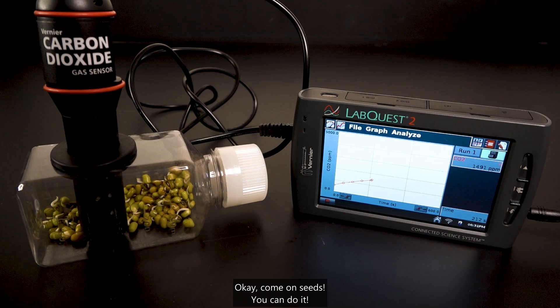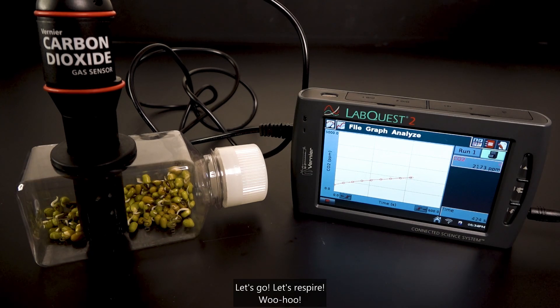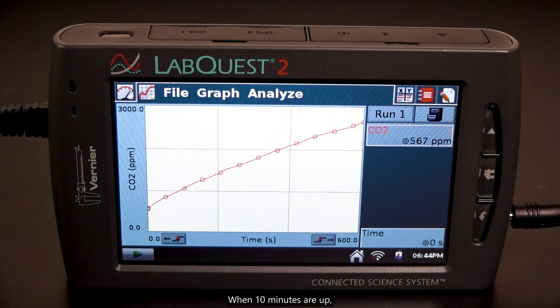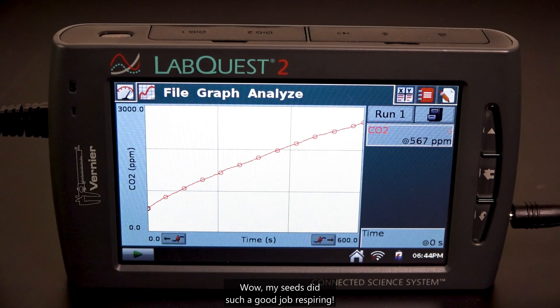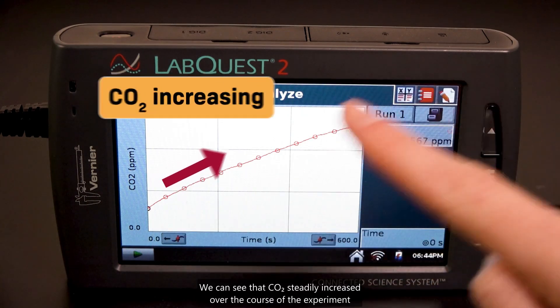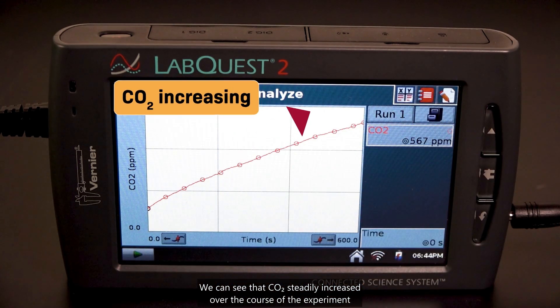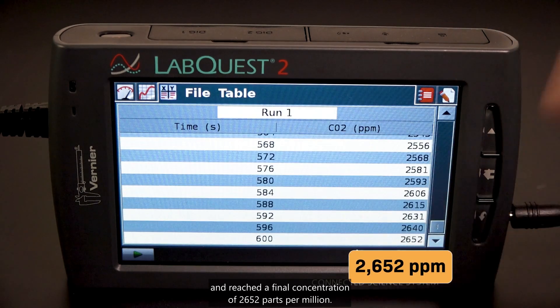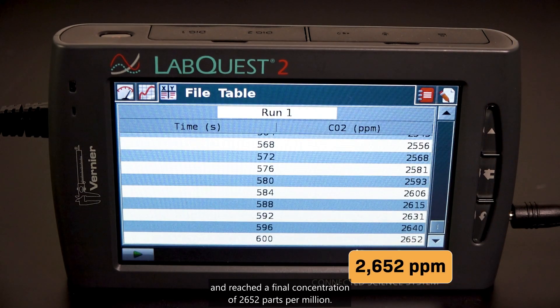Okay, come on seeds, you can do it! Let's go, let's respire! Woohoo! When 10 minutes are up, the sensor will stop recording and I can see my final graph. Wow, my seeds did such a good job respiring! We can see that CO2 steadily increased over the course of the experiment and reached a final concentration of 2,652 parts per million.